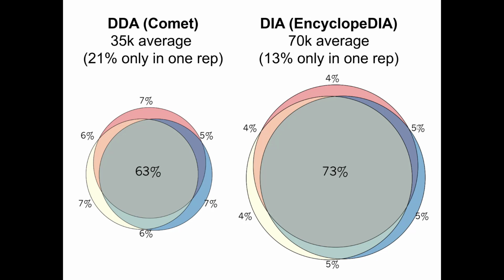This is actually much worse if you're starting to look at phosphoproteomics, where you might have the overlap between 3 different samples be around 40%, or a third of the peptides actually are one on top of another. And that actually has to do with a wide variety of other reasons.